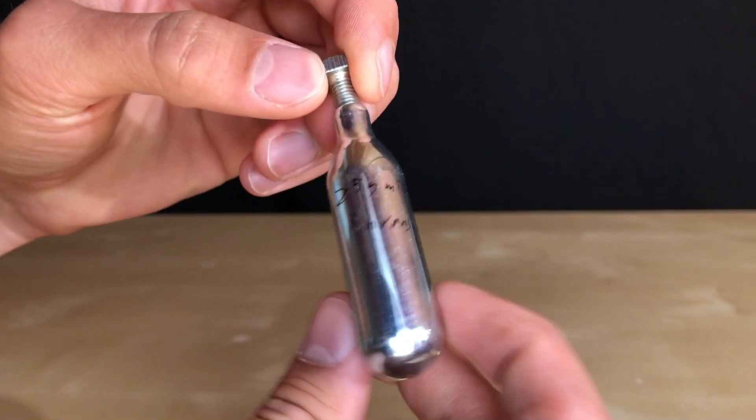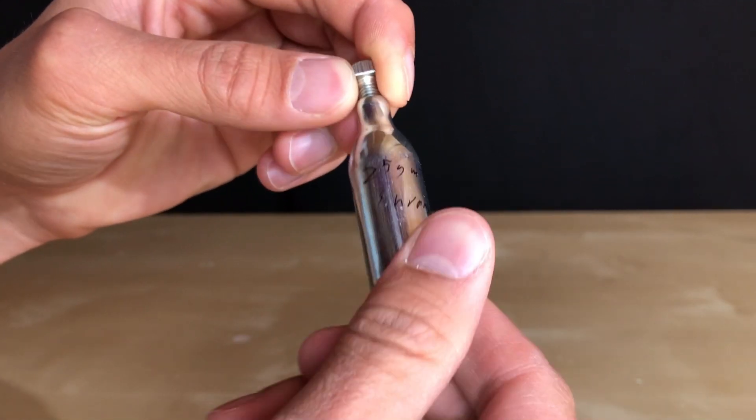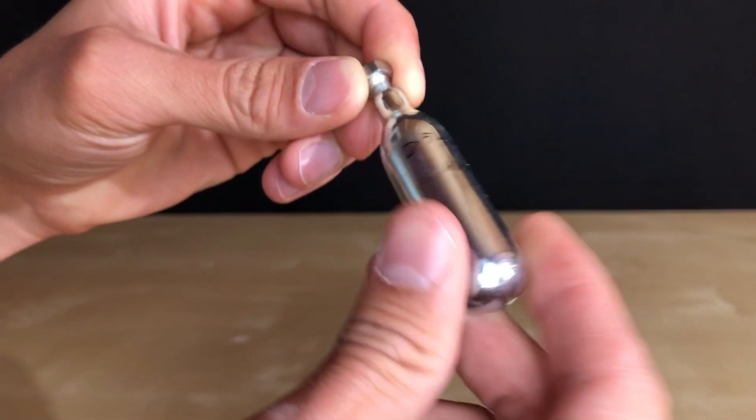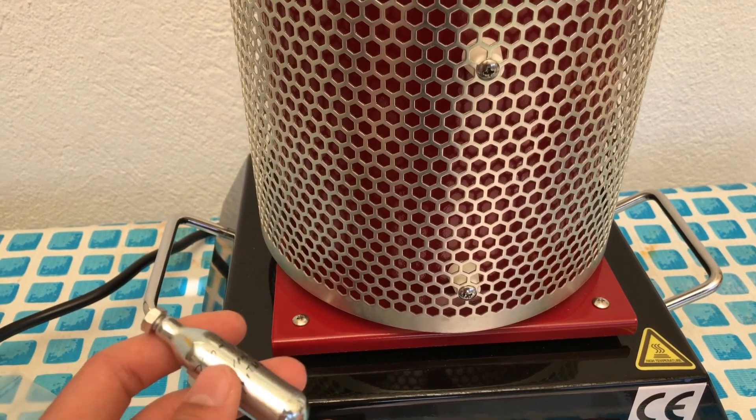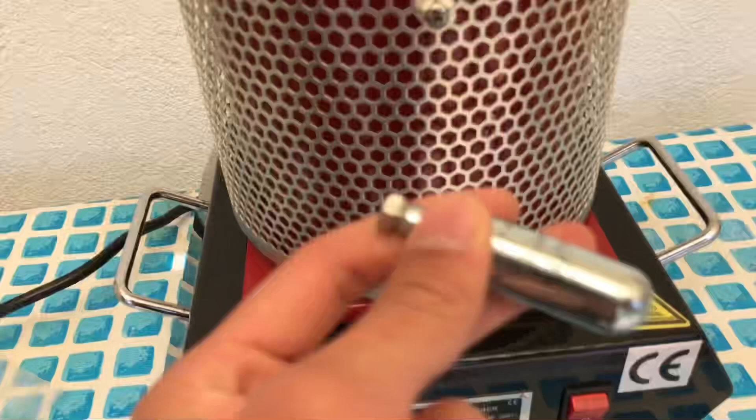The reaction vessel must be able to withstand high temperatures and it must keep the air out. The easiest method I found was to use one of these steel containers. Into the top I cut the thread and the screw is also made from steel.